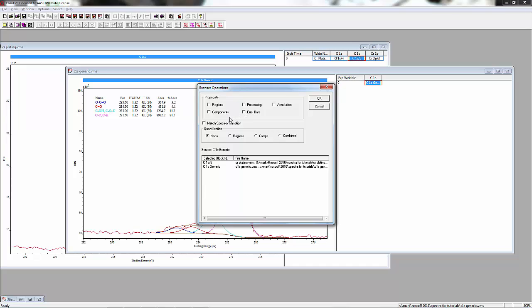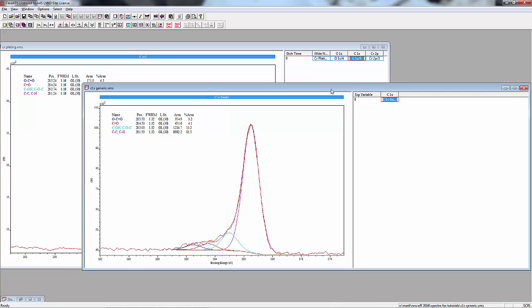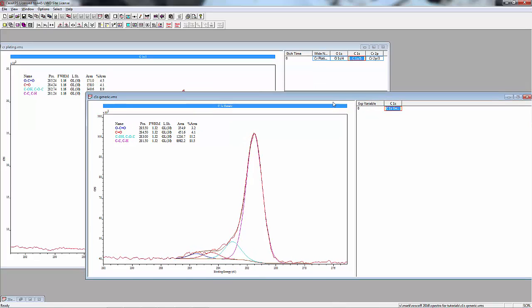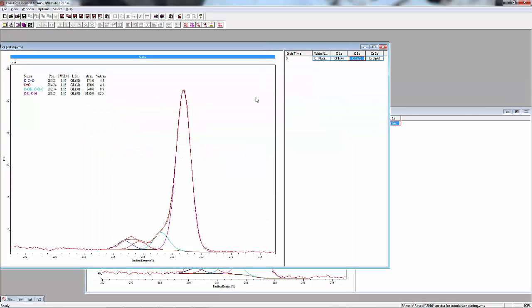We're going to click on Regions, Components, and Annotation and hit OK. So now we've propagated what we have here in this spectrum to the other spectrum, and you can see it's already a fairly good fit.